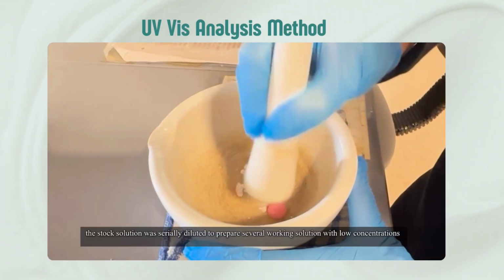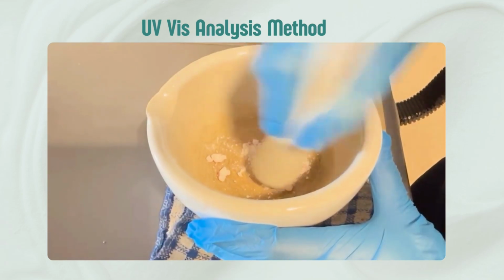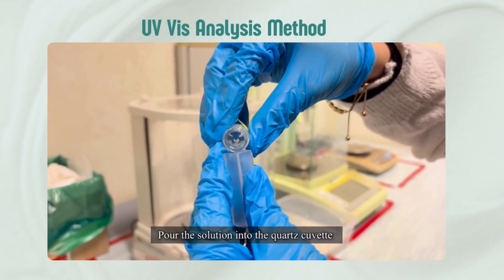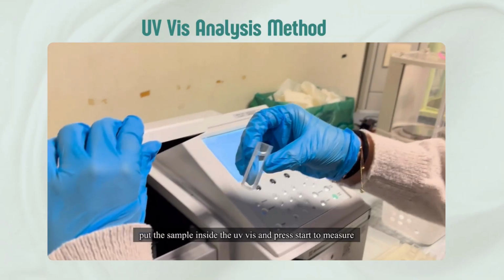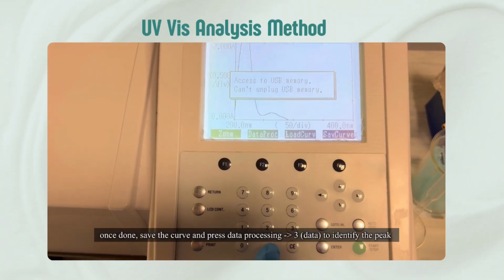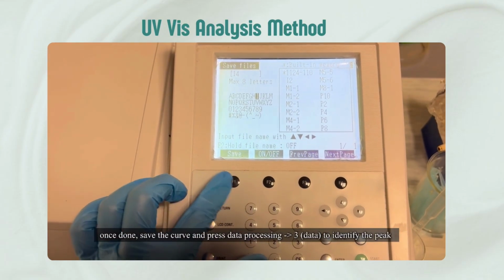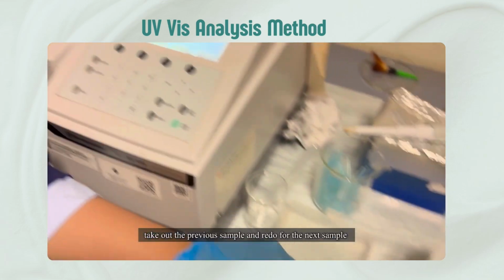The stock solution was serially diluted to prepare several working solutions with low concentration. Run the baseline, and the scan range for both drugs is as such. Standard solutions for both drug samples were prepared in different concentrations. Pour the solution into the quartz cuvette. Put the sample inside the UV-Vis and press start to measure. Once done, save the curve and press data processing to identify the peak. Take out the previous sample and redo for the next sample.